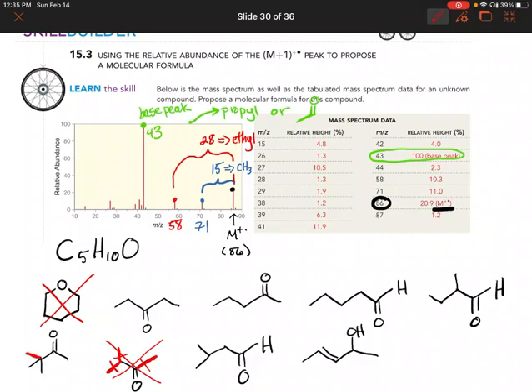Also, the one next to that, this one, there's really only methyl groups that could be lost, or a tert-butyl group. So I don't think that's our molecule either. Okay. And then looking at the other molecules, there are potentially some losses here.